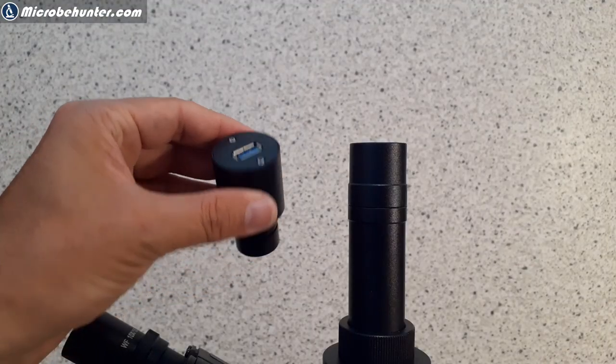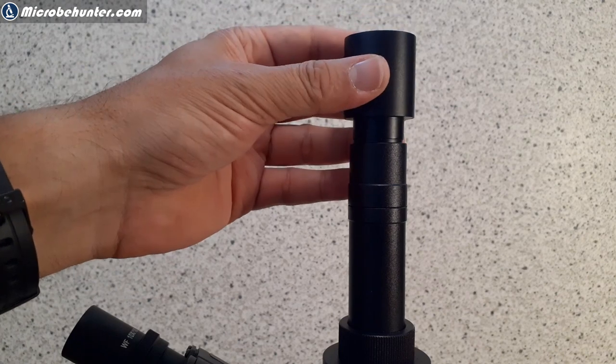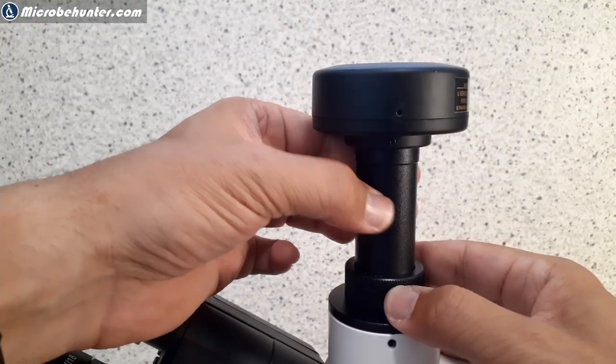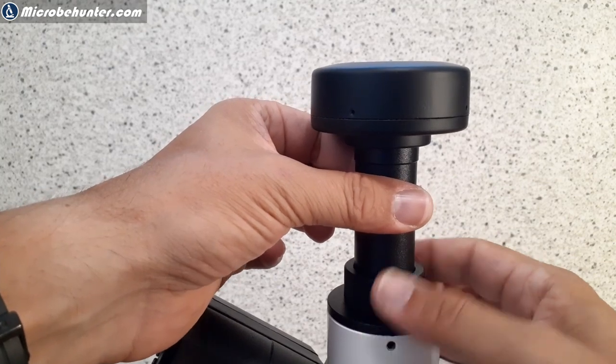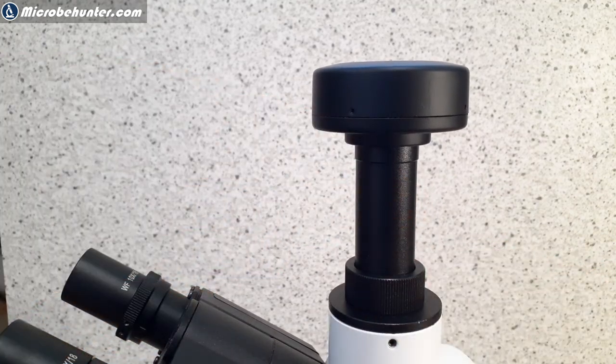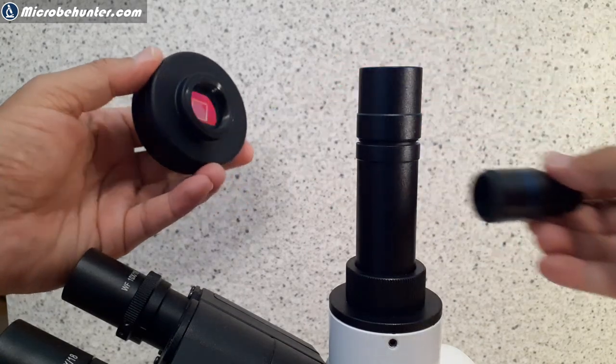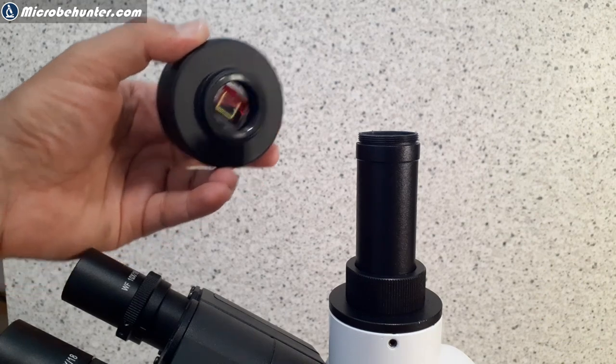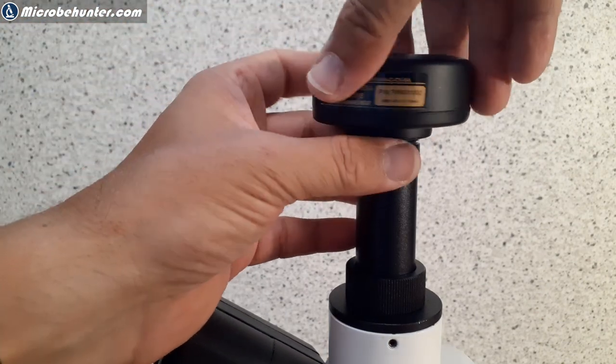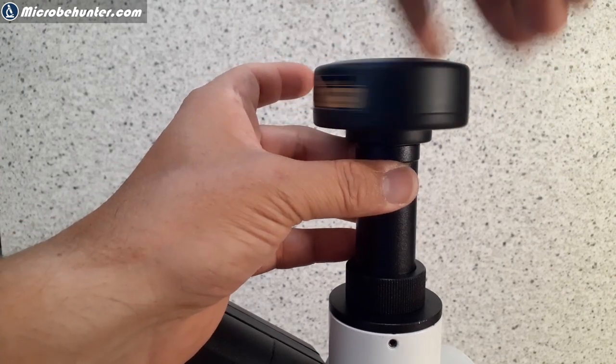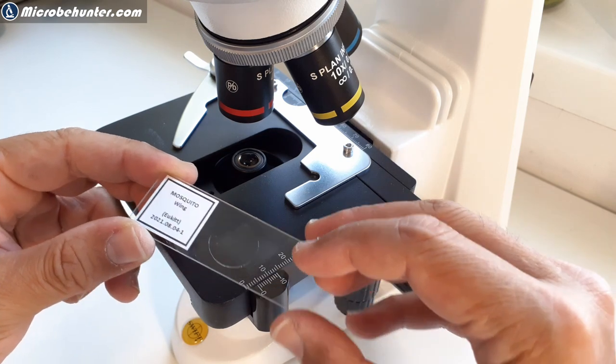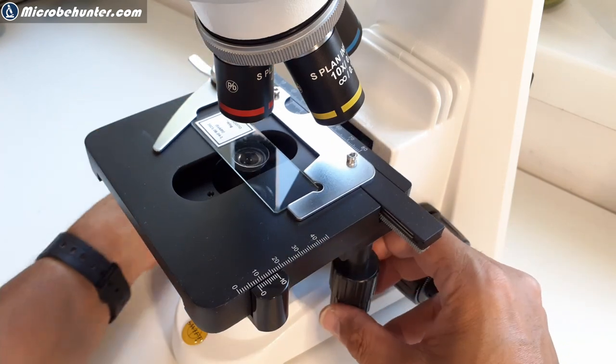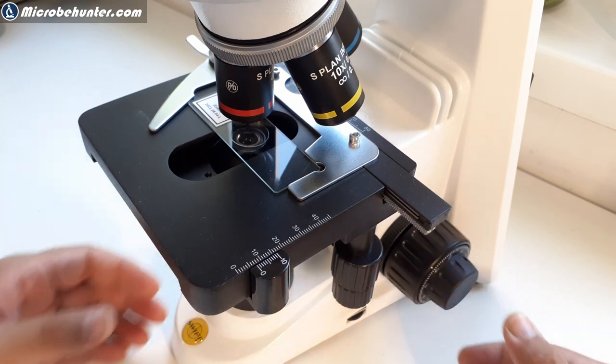So now let's connect a camera. The camera, it's an eyepiece camera that can simply be dropped in here at the top on the photo tube. And here you can also adjust the distance a little bit to make sure that it's parfocal. It means that it's in focus when you also look through the eyepiece and the camera should be focused at the same time. Or you can now detach the optics of the camera. Then you have a C-mount and you can also connect it directly to the microscope as well. So that is also something that I like, the options that are given to me. We're now going to have a look at some specimens under the microscope. So I'm going to put a mosquito wing now on the stage. And we're going to now have a closer look at this. And you can move it all the way to the top end. Let's get started.